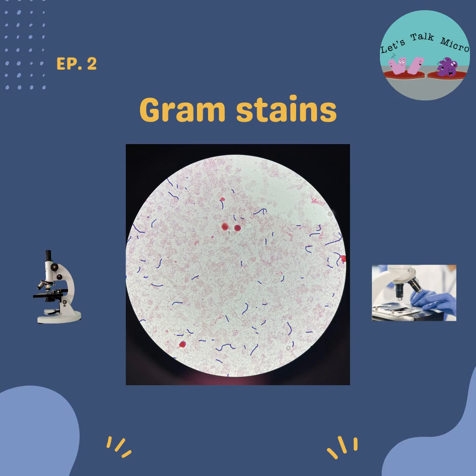It takes a while. I mean, microbiology is all about practice. With the decolorizing, even techs with many years of experience can either over or under decolorize a lot of times. But with experience, you also have a better idea what you're looking at. So even if you mess something up on your staining, you know that something is up based on the way the colonies look on the plate, based on what you know about gram stains, the cell arrangements.